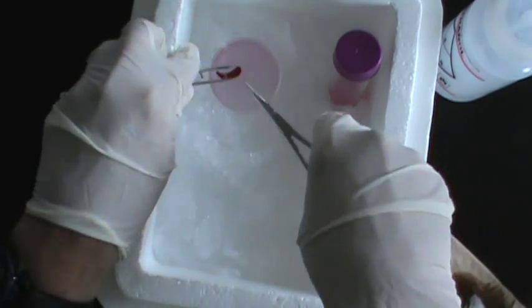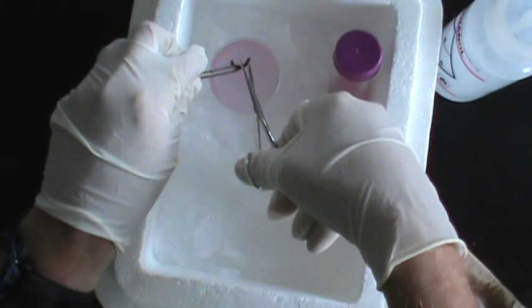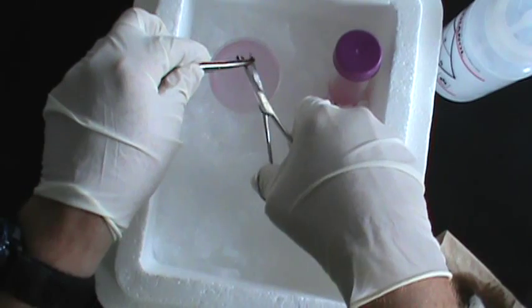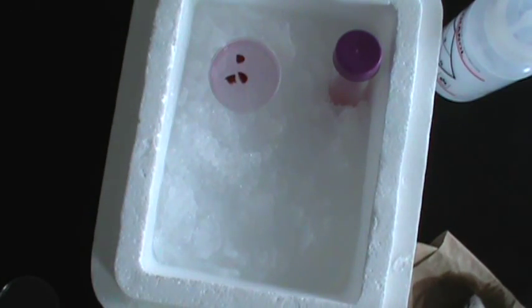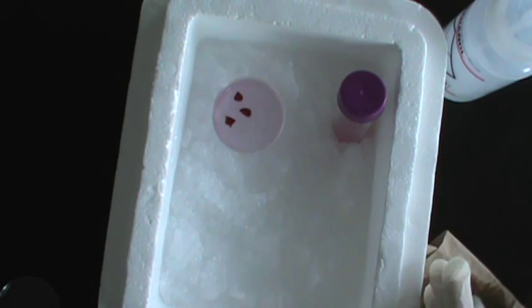With the scissors, cut the spleen into three or four pieces depending on its size. Now what we want to do is we want to take this spleen and smash it into a single cell suspension. One of the reasons we use the spleen is because it does not contain any connective tissue and so it can easily be broken apart.